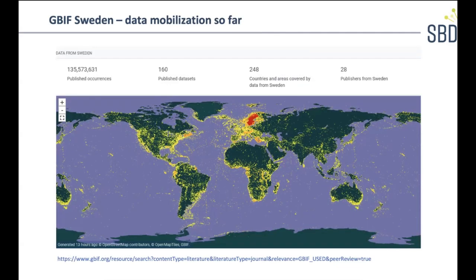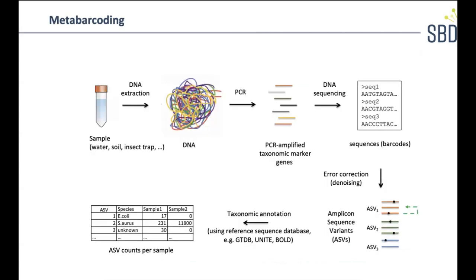Yeah, okay, so that was a bit of a general background about SBDI and GBIF. And now we'll focus more on the metabarcoding part, which we in this group are responsible for contributing to SBDI. So I guess all of you, or most of you, know what metabarcoding is, but if there's someone that doesn't, I will very briefly tell you how it works.